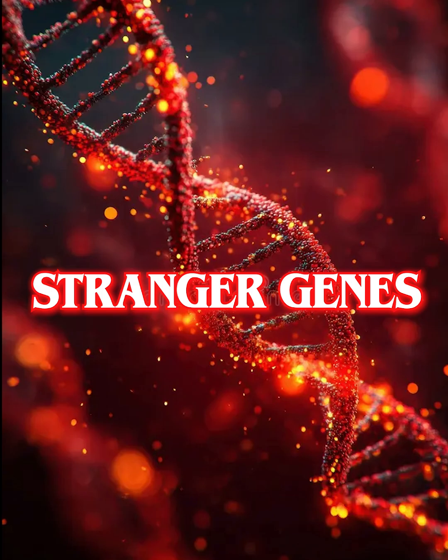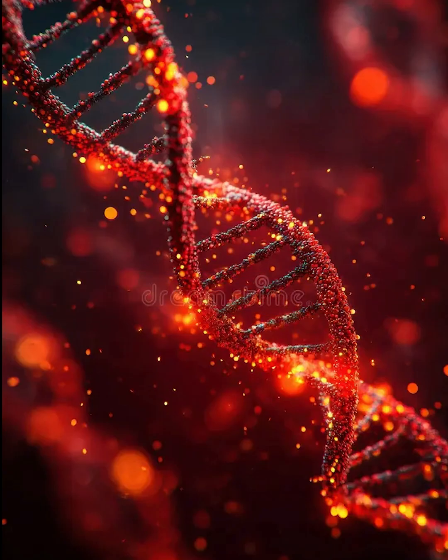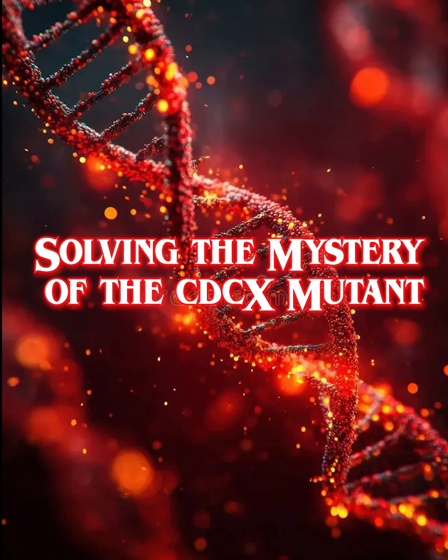Welcome to a day in the genetics lab. Today, I'll walk you through the full journey of identifying a mysterious yeast mutant, CDCX, using transformation rescue and recombinant DNA cloning. This is a real story from our semester-long investigation.